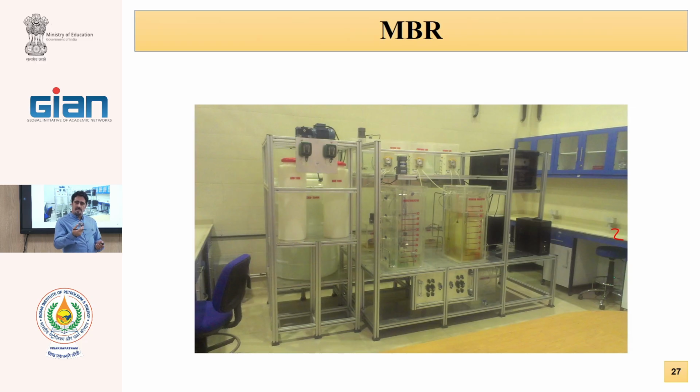For separation of the microorganism from treated water, we usually use immersed microfiltration or ultrafiltration. Usually a similar setup is used. You see we have some suction pump. This is yellowish, usually filled with the aeration tank. And maybe we can have anaerobic, without aeration. This is usually aerated, and this is usually non-aerated. I have a video we can show.